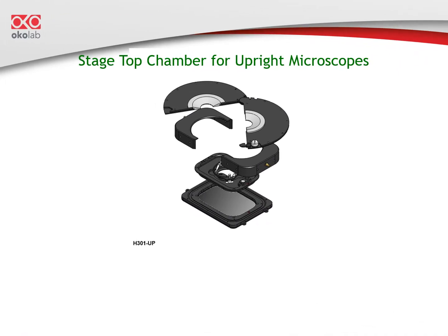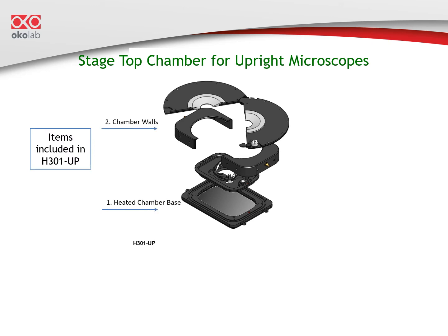Here is an example for upright microscopes. It's compatible with multiphoton applications. There are several components to the chamber. From the bottom, a heated base with an adapter to your specific stage, brand, and model. Chamber walls, a heated lid. The heated base is secured to the stage.